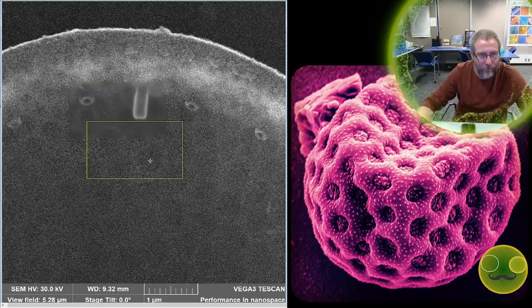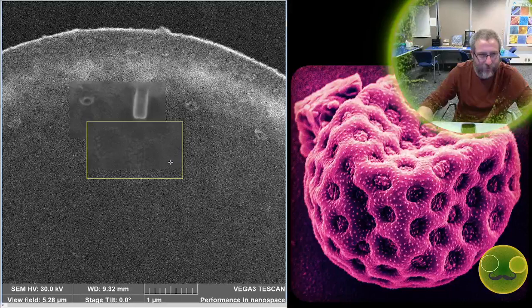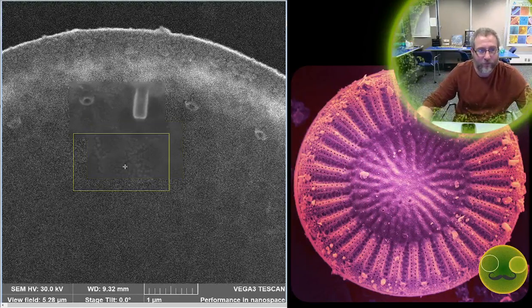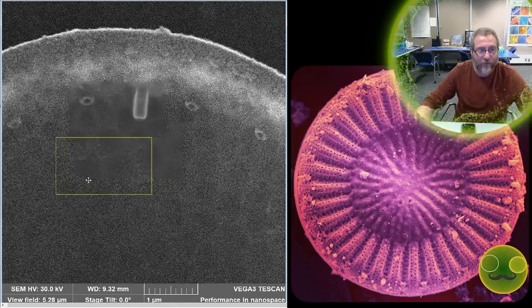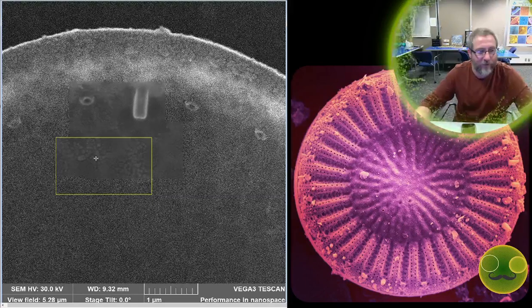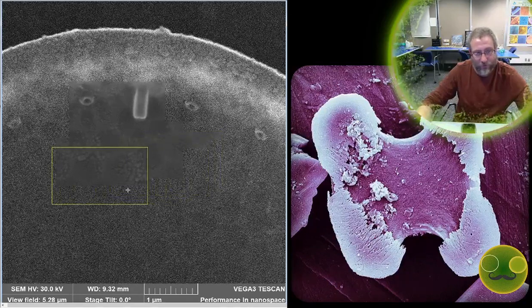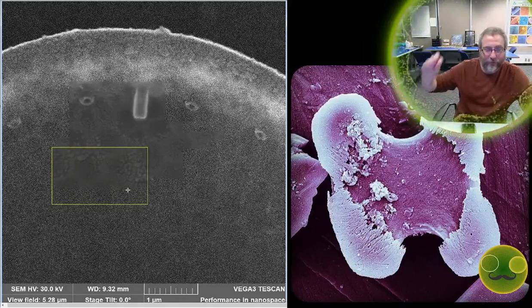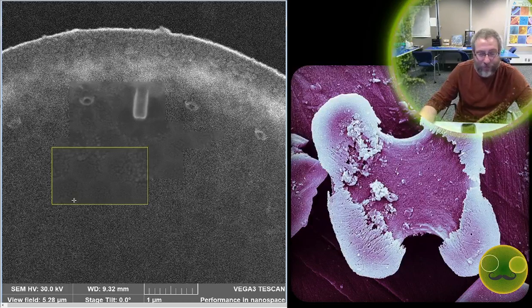And then there's another bit of terminology here, which is relevant, which is these little tiny salt and pepper shaker-like openings that you can see here. There's sets of them all around on the surface called areoli, and they're just like a simple covering over a hole that goes to the outside. And the simple covering part is called a cribra, with a bunch of little tiny holes, like a salt and pepper shaker. And these are mostly used, if people are asking that question, to communicate with the outside world. Not by text messaging, but to pull nutrients in, or squeeze waste products out, or to bring in dissolved gases, for example.